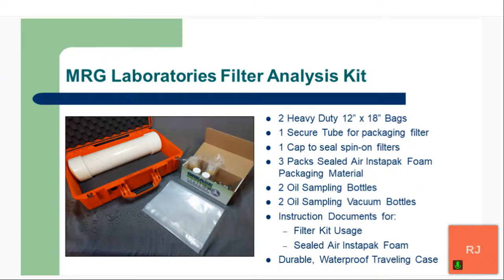And then also we can see there the bright orange durable and waterproof traveling case, and that's what's going to keep our overpack and our samples safe while they're in shipping.